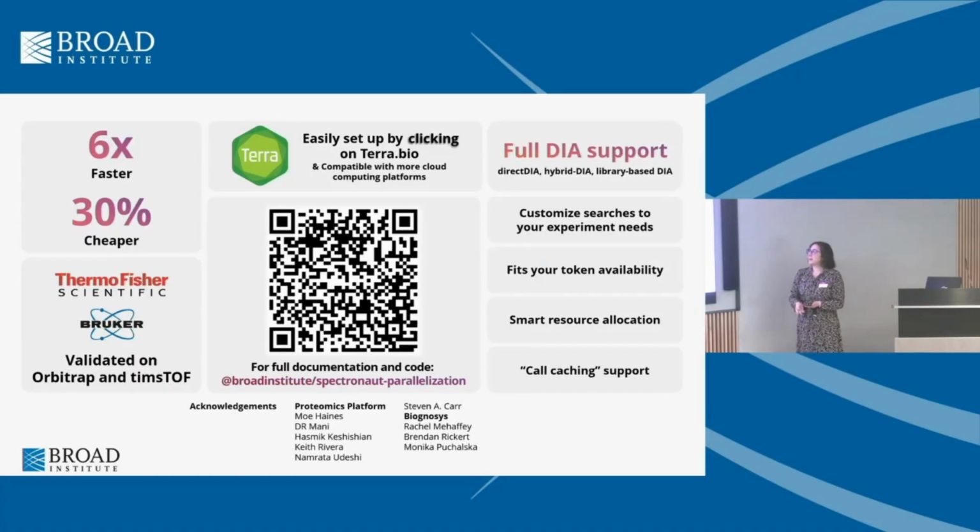So to conclude, our parallelized workflow is up to 6 times faster and 30% cheaper than the serial workflow. We validated on both Astral and timsTOF HT systems. Here is the QR code to our GitHub page, which has everything you need, the Docker, the workflow, and a really detailed README to help you get started on Terra or whatever cloud platform of your choice.